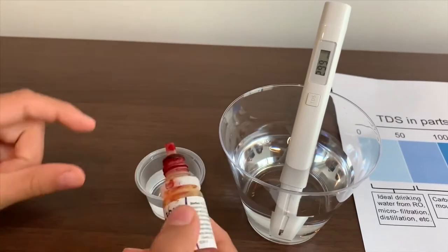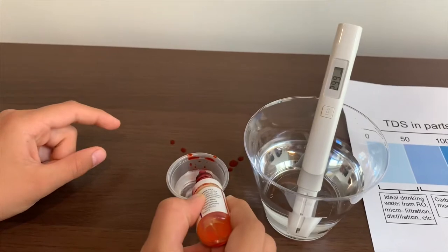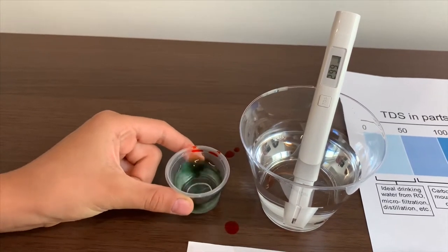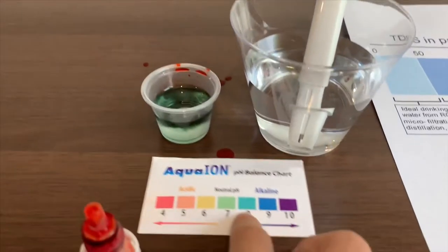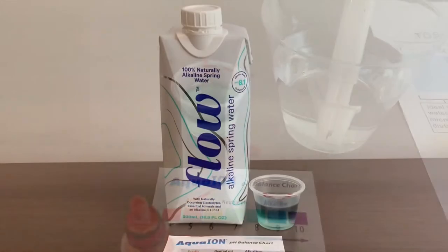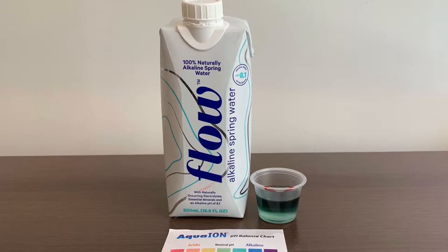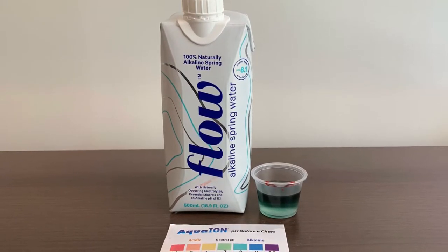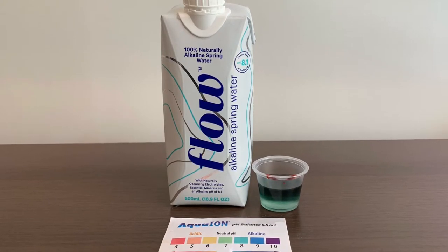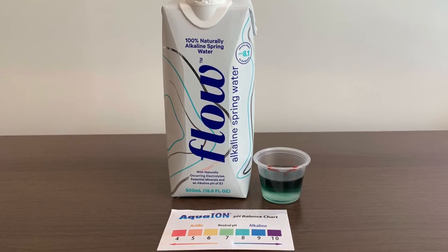Two drops on it. It is close to A on the color chart. Turn on the pH meter. There we go — all set up. Thank you.